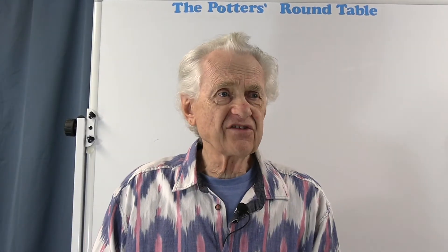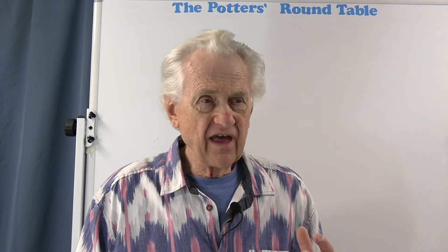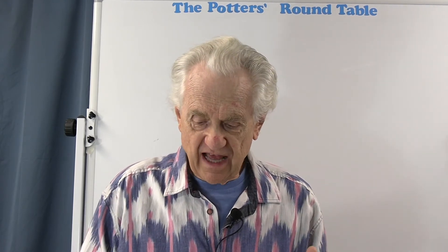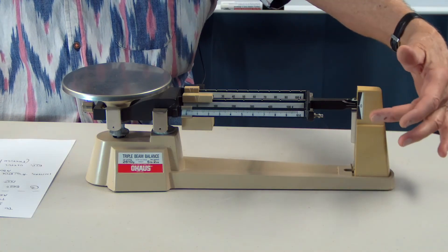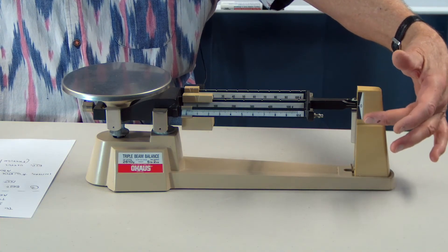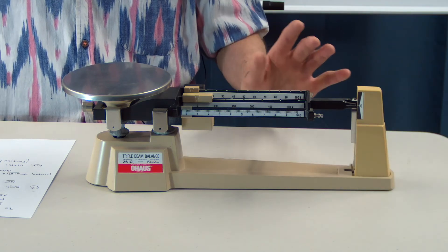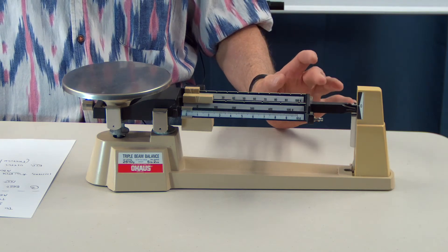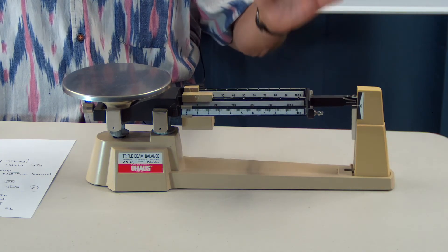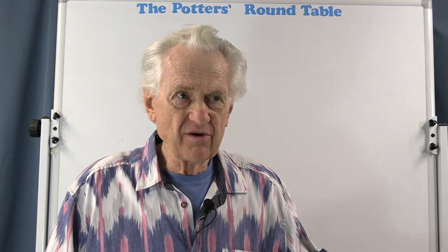The third and final tip, which is really the most important: the best way to read the weight when you're weighing something is not to just allow the indicator to come to rest at zero. A more accurate way is to actually let the arm swing and watch the swing, looking for an equal swing above and below zero.